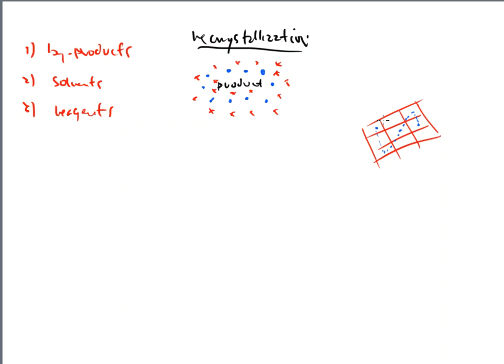But when this crystal begins to form, what happens in the very beginning is that sometimes we get an impurity. And that impurity gets trapped into that crystal cage. And we get another one, and another one, and maybe another one. And we have to get rid of the impurities. The problem, though, is that it's embedded now into the product. The product is basically caging these impurities, and we need to get rid of the impurities.